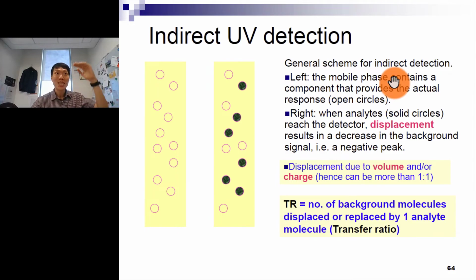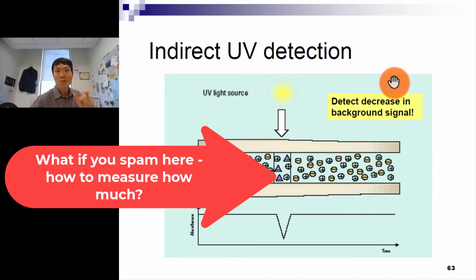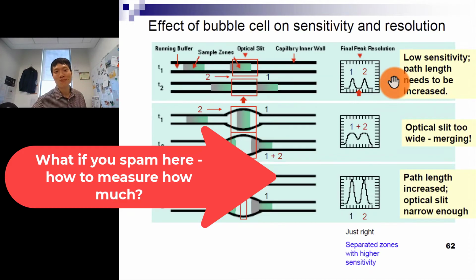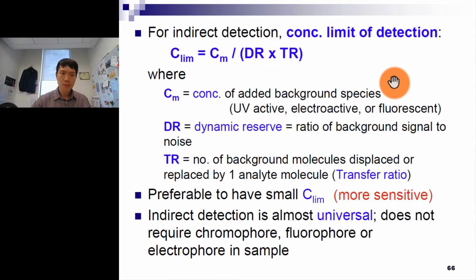If you can measure higher, you know there's always room to grow to measure the absorbance of your analyte. But if you have a lower limit in this case, you can only say, okay, I block everything, it is 0. But what if there's a higher amount of your analyte within that space? Think a bit more.